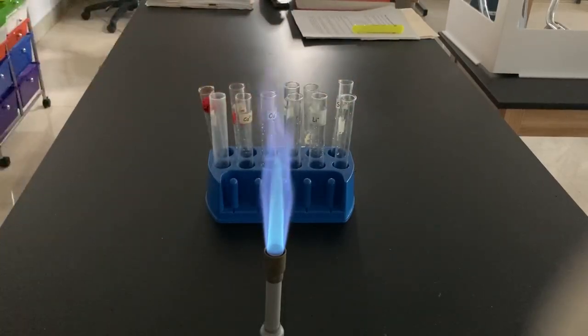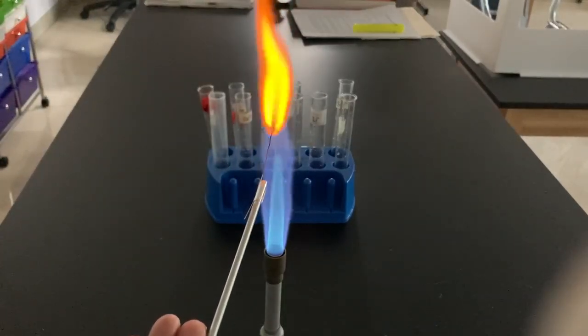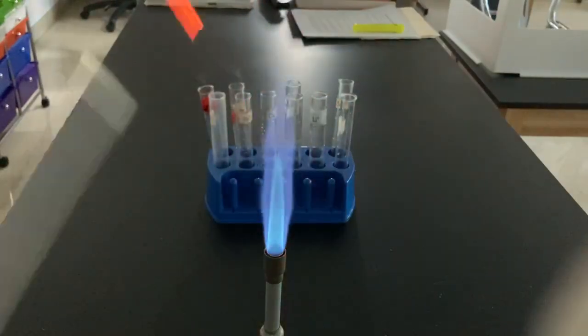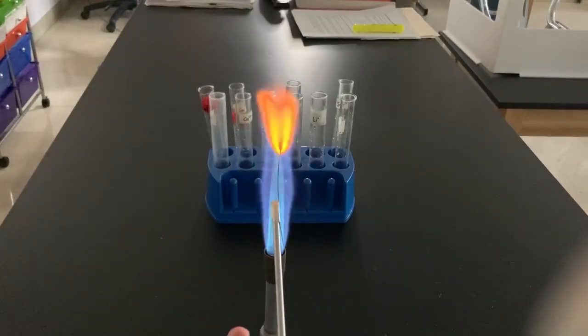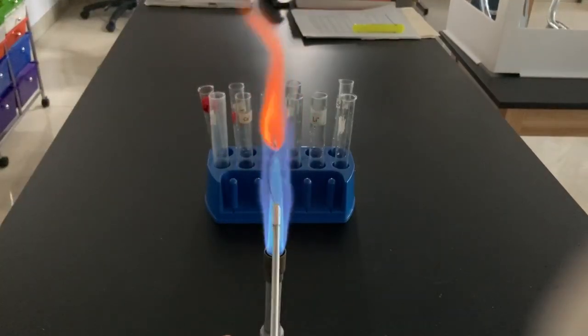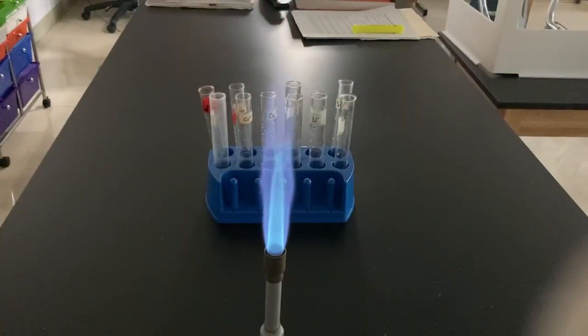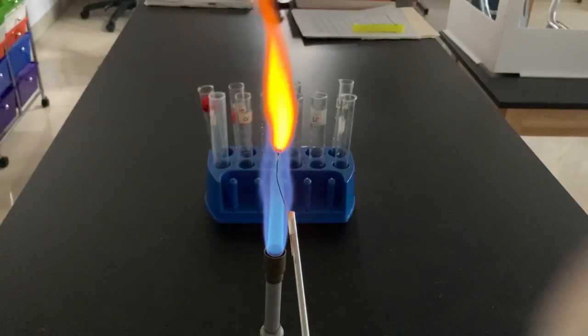And then lastly, I'm going to test two unknowns, and I'm going to leave these up to you — I'm not going to give it away. You're going to have to try to figure out what elements are present. Here's unknown A. I'll test that again. I don't know if I like that red in there. Let's try that one more time. Unknown A — okay, there we go.